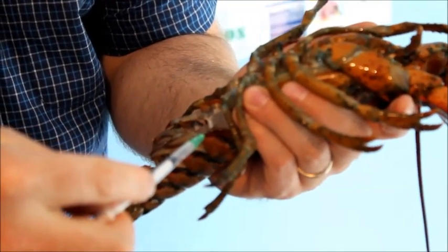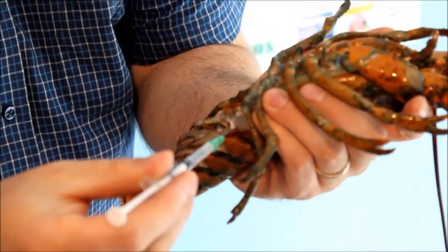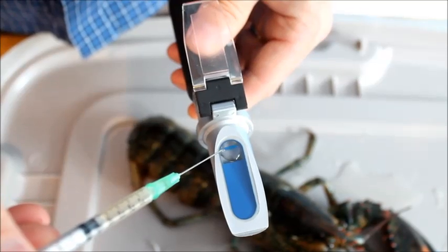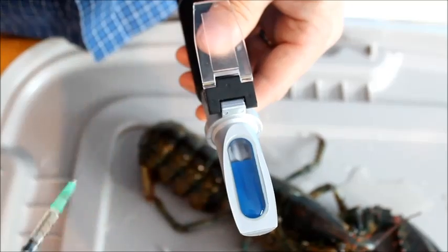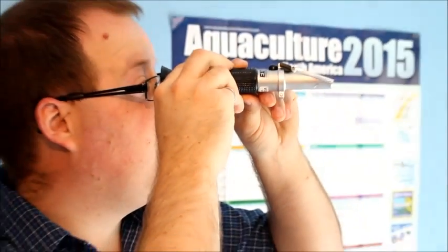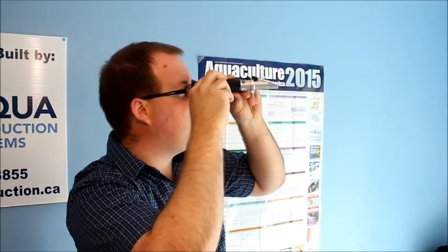Lift the flap off the refractometer face, cover the face with drops of the fluid from the lobster, close the flap, and you're ready to measure. Hold it up towards the light and you should be able to see on the refractometer scale a dark shadow that crosses the scale.